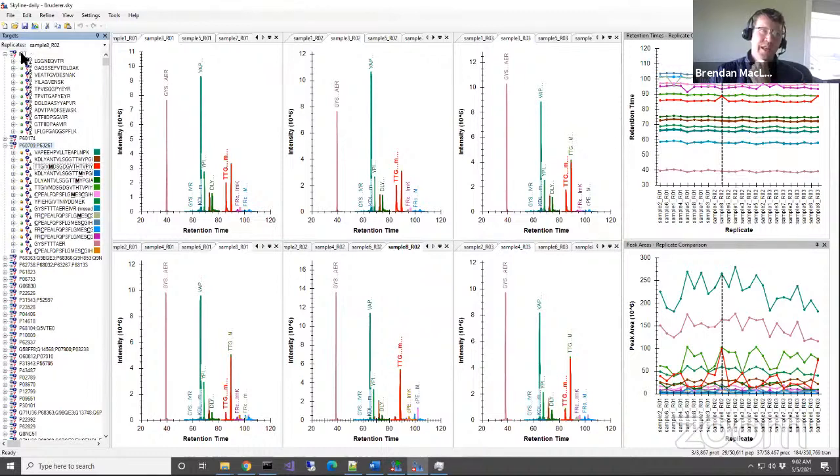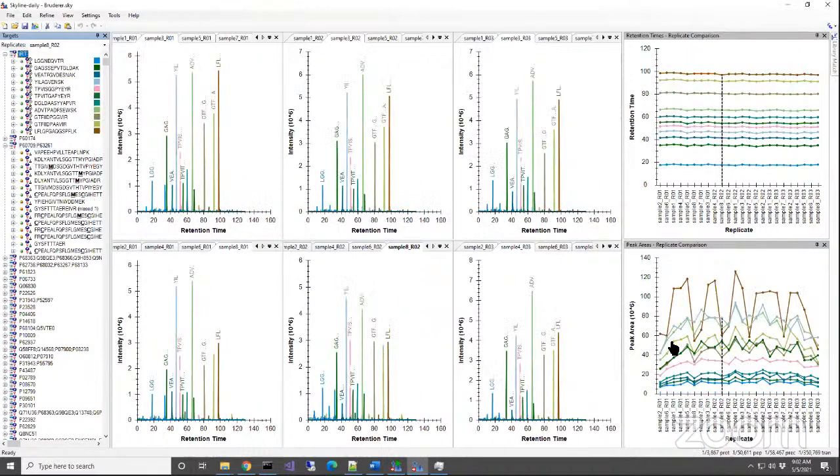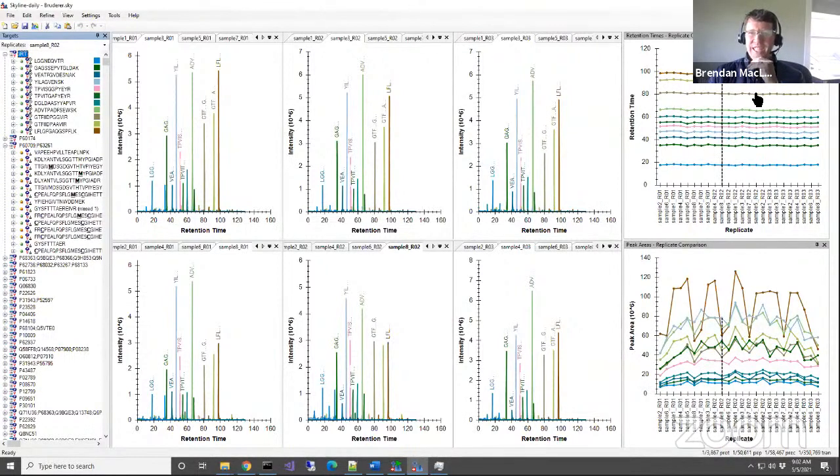So I'm going to say, boy, you really wouldn't. I think actually Biognosis has done recent things to improve the peak areas of the IRT standard. So you might have to go back. This is a pretty old experiment. I think they may have noticed some of this variance too and improved how they're produced. So don't take the way they're performing in this particular experiment as indicative of how they are now, 6 years later.